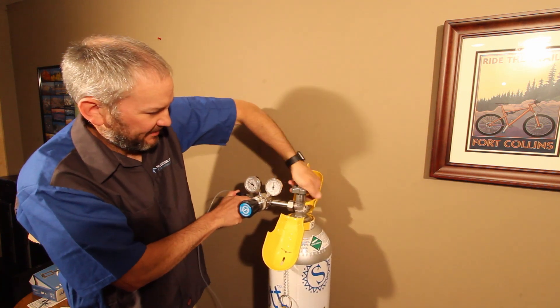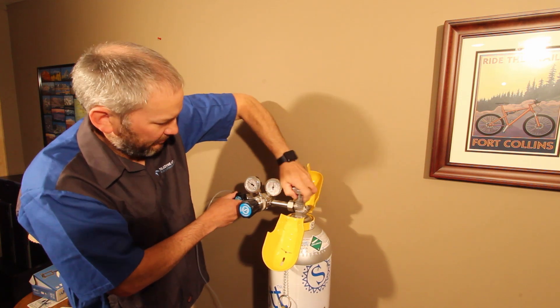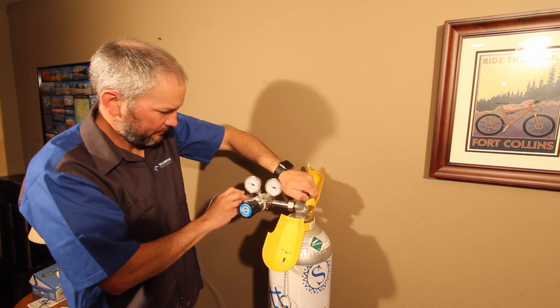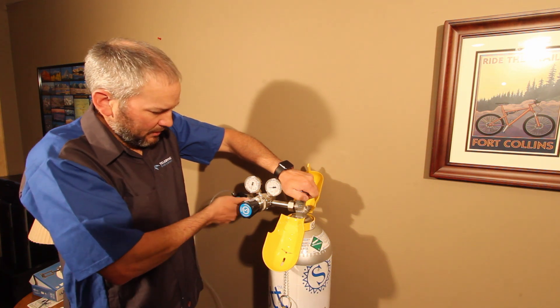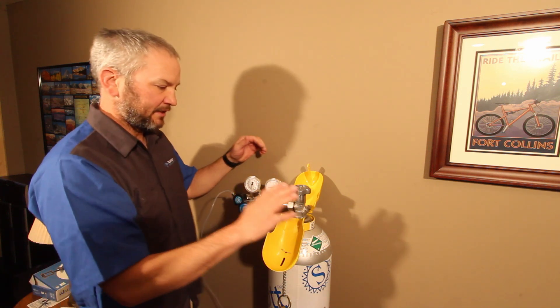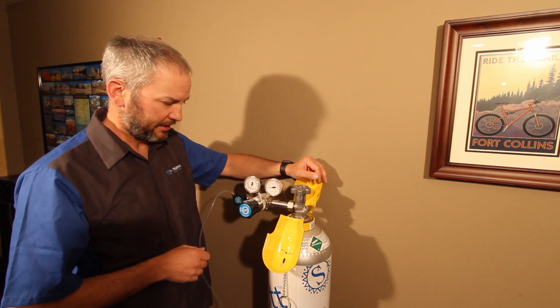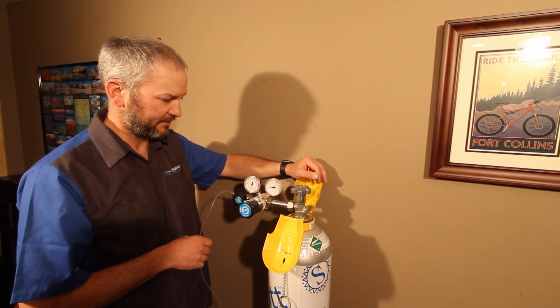We obviously want to practice safe cylinder storage and use carts and have these guys secured when we're working on them. That's the technique. Right now we can say that this cylinder regulator is properly purged. We can feel confident that when we hook this up to our calibrator and dilution system, we're going to get repeatable, stable concentration outputs from that system. Thank you.